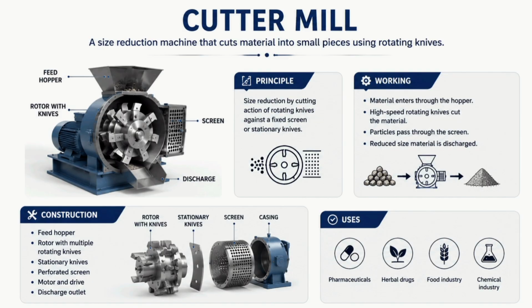Working. Students, let us see the working of this cutter mill. The cutter mill is mainly used for fibrous materials only.